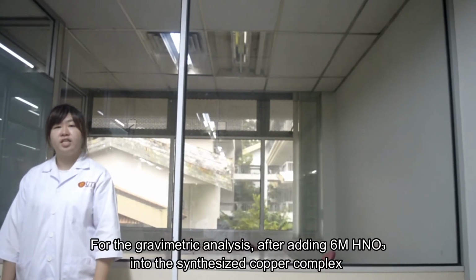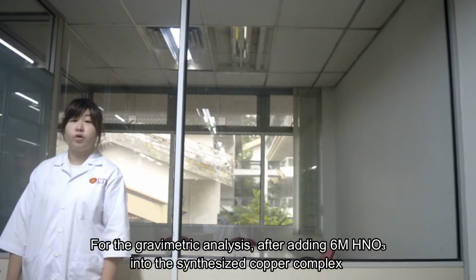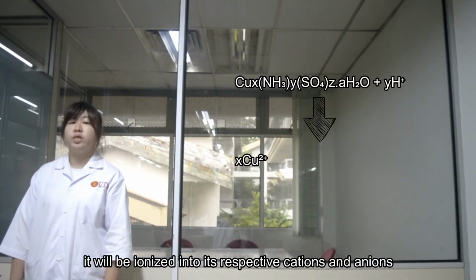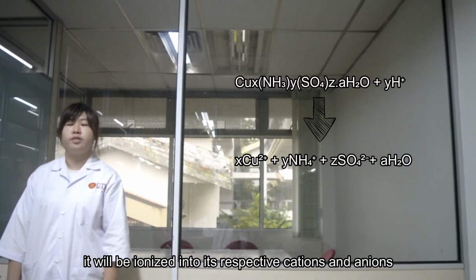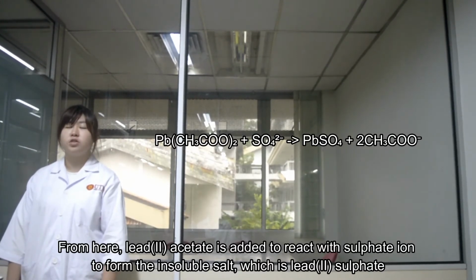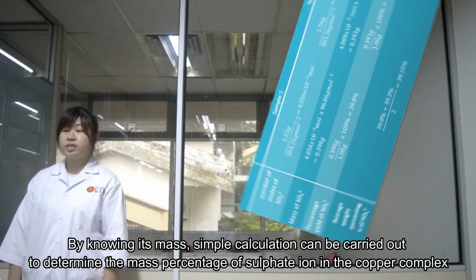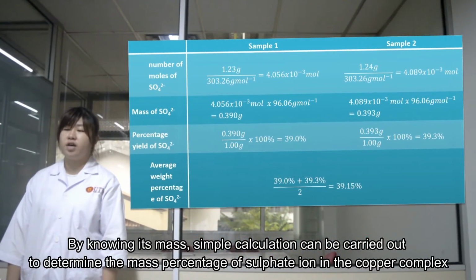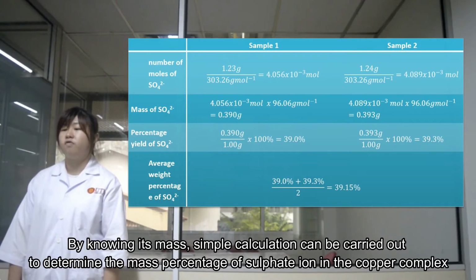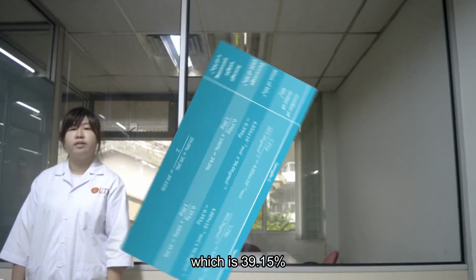For the gravimetric analysis, after adding 6 molar nitric acid into the synthesized copper complex, it will be ionized into its respective cations and anions. From here, lead-2 acetate is added to react with sulfate ion to form the insoluble salt, which is lead-2 sulfate. By knowing its mass, simple calculation can be carried out to determine the mass percentage of sulfate ion in the copper complex, which is 39.15%.